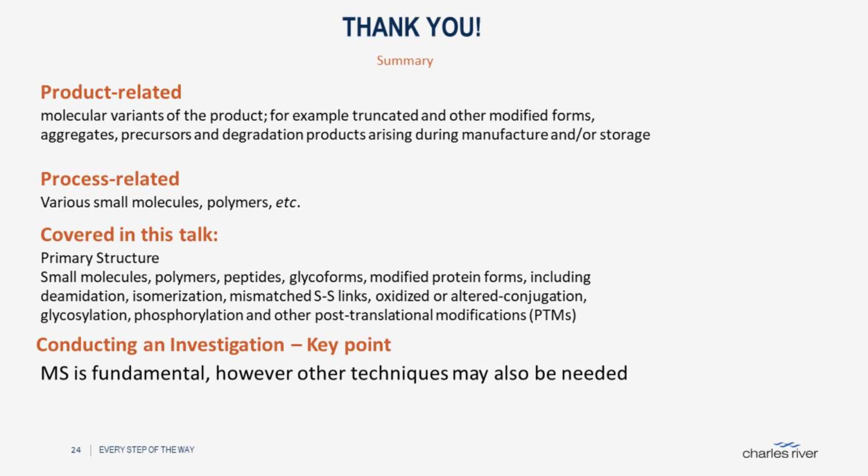Okay. Can you describe the procedures that you use to clean your machine and prevent cross-contamination and minimize biosafety risks? Oh, that's an excellent question.